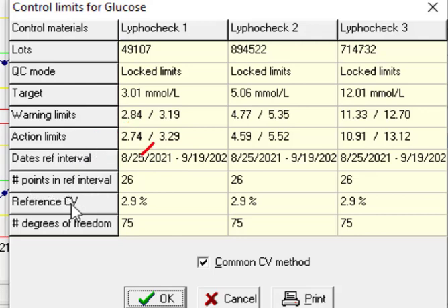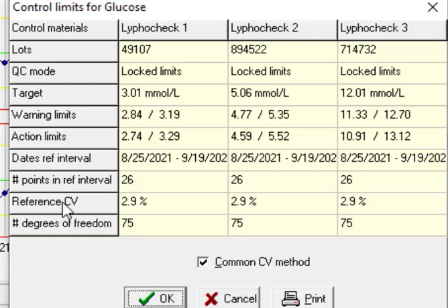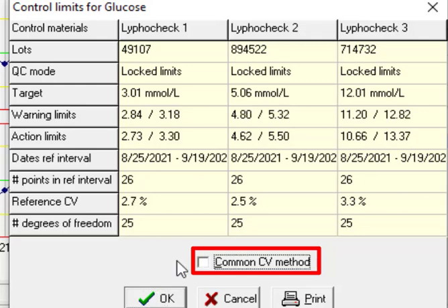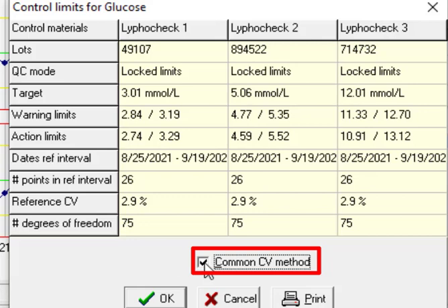The number of points was 26. Reference CV. We can use common CV or we can specify a CV that the software will automatically calculate for each level of control. For example if I put a check in this box.